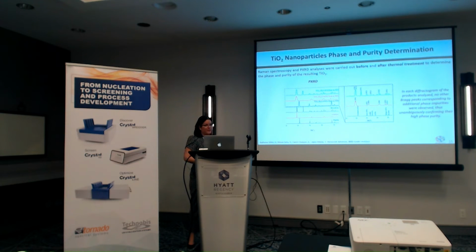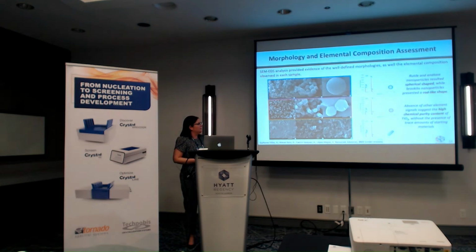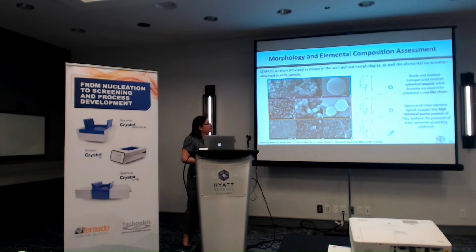So that confirmed that we have phase pure titania in each of the 3 phases, depending on which of our aqueous media we employ to use the phase inversion temperature in the crystalline. We also did SEM, EDS to characterize the morphology.